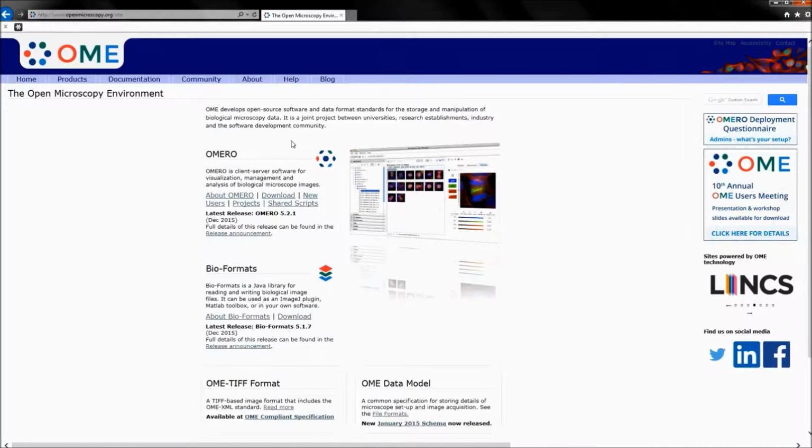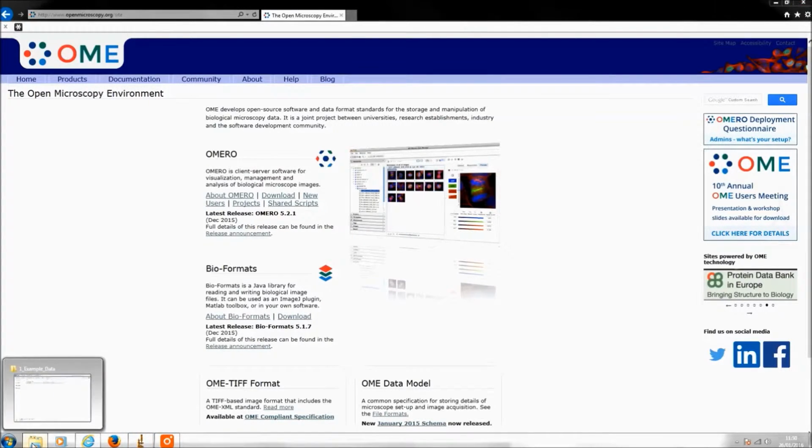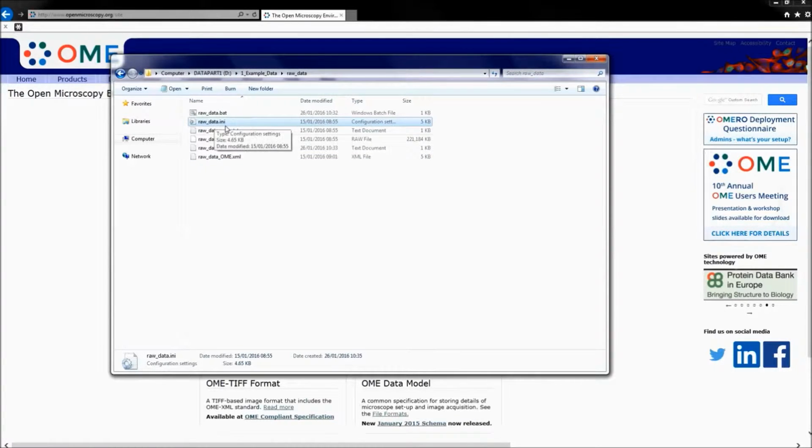All TIFF files recorded from SciScan will now include the OME XML metadata in the header as standard. Raw files lack a header to write the metadata into, so instead we write a copy of the XML file in text format and save it alongside the image. To ensure that existing workflows and analysis routines are unaffected by this change, we're going to continue to save a copy of the INI configuration file alongside the data every time an image is recorded.